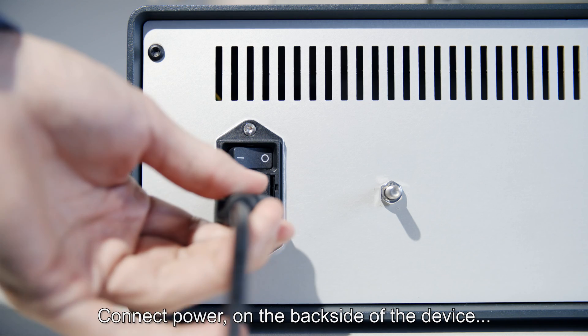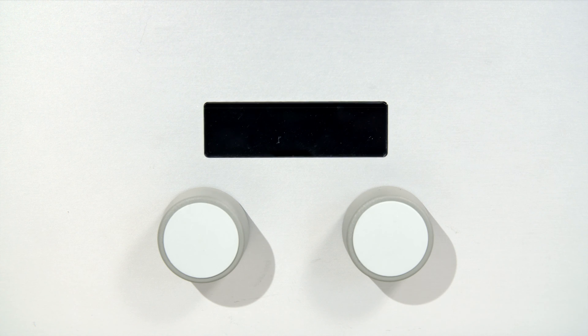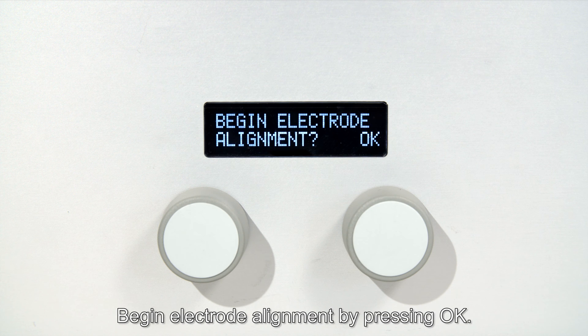Connect power on the back side of the device and turn it on. Begin electrode alignment by pressing OK.